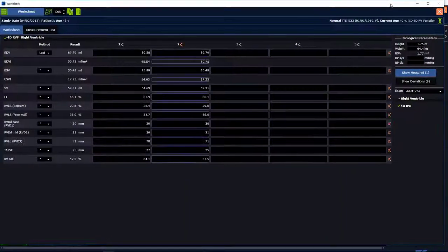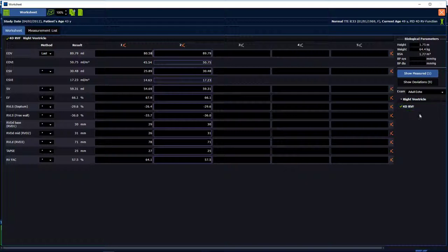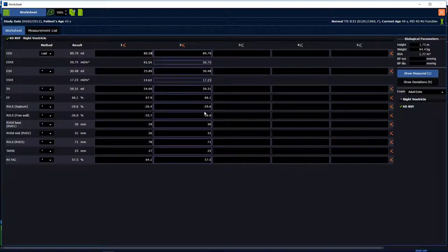If we open the worksheet on the right side, there is a checkmark for 4DRV. These are the results from our application, and these results are available for your reporting system.